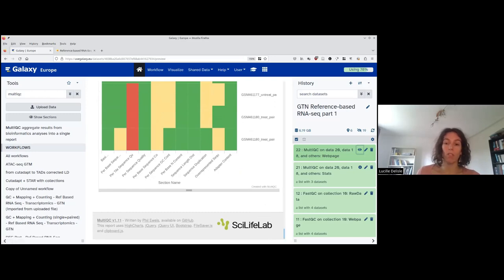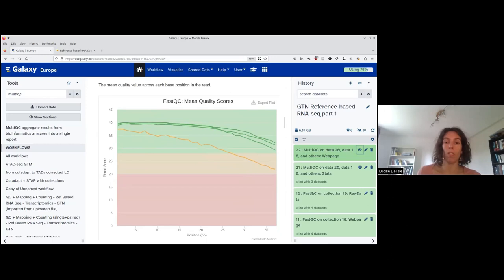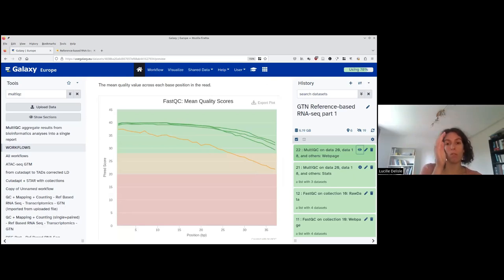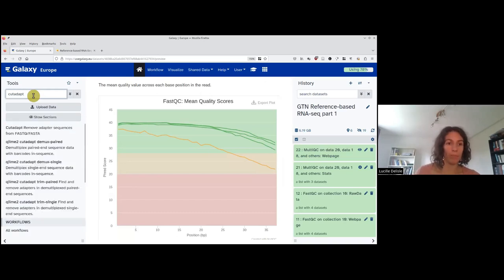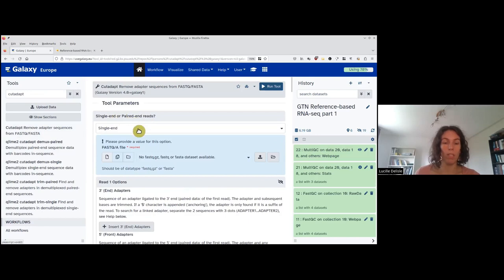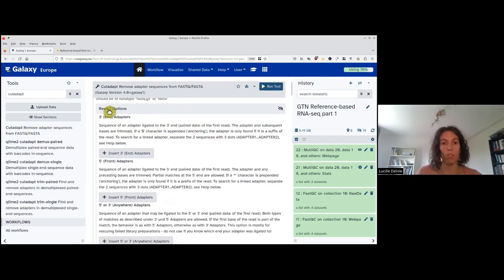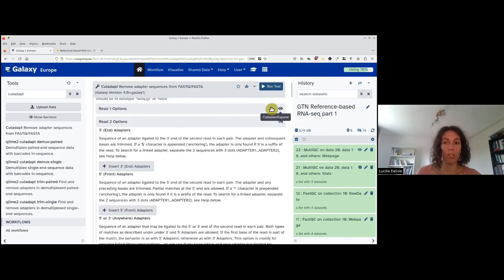As we saw, there is a tendency of decreasing quality at the end of reads, which may affect the mapping step — when we assign reads to a region on the genome. To clean the dataset, we will use CutAdapt to remove the low-quality bases from the ends of the reads. We search for CutAdapt. The tool asks if it's single-end or paired-end reads — we have paired-end tied into a collection. As I said, we don't have adapters, so we won't set adapter removal options.